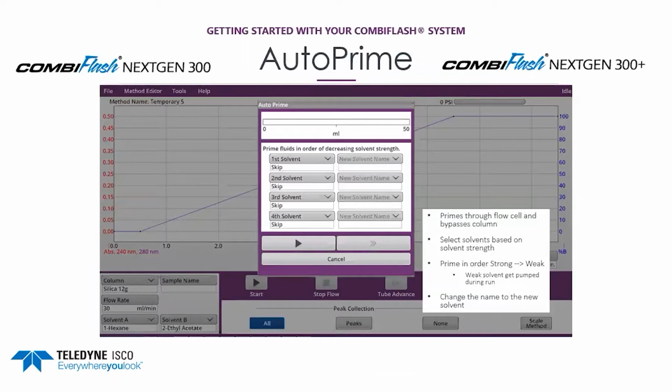First, loading the solvent, you access the auto prime from the tools menu item. Priming order is important. Priming the solvents in the correct order makes sure the pumps are filled with the correct solvent to start the run. We don't want strong solvent at the start of the run because it causes poor chromatography.